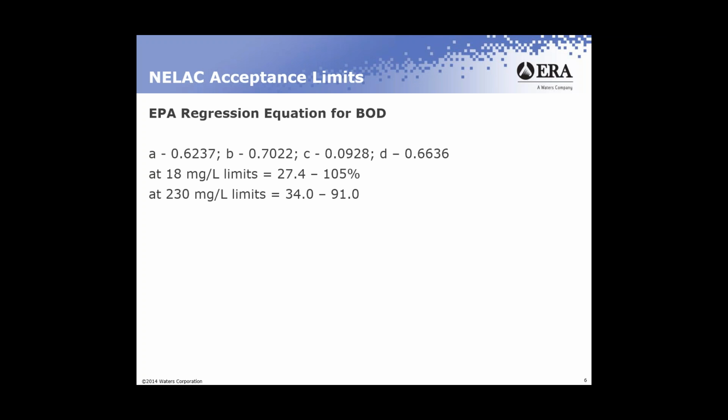then collects the information, generates what they call expected acceptance recoveries, and generates what they call expected standard deviations, which is the variability in the method. So if you've run proficiency tests before, if you've done DMR/QA in the past, your data is in this database, and it helps to generate these regression equations.